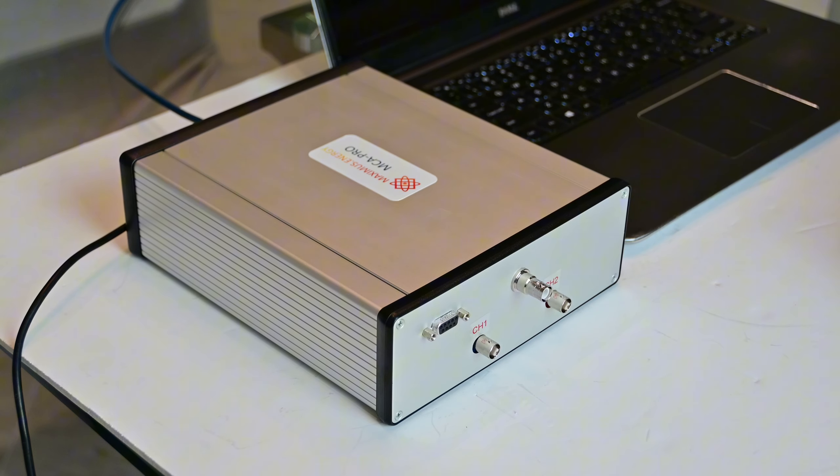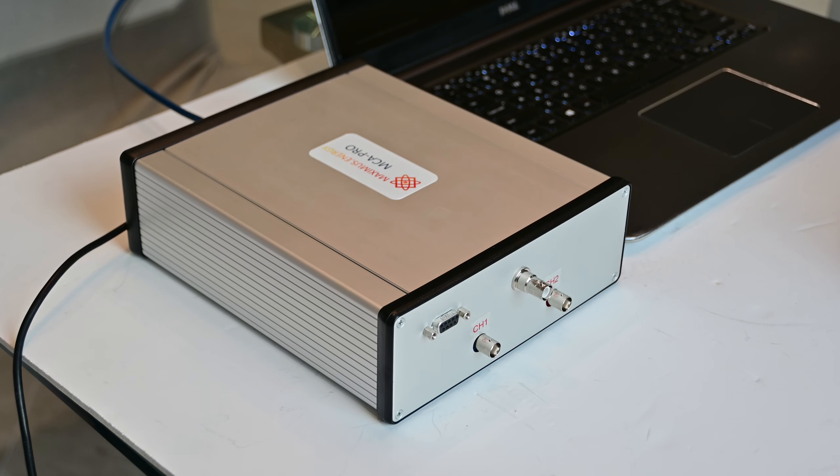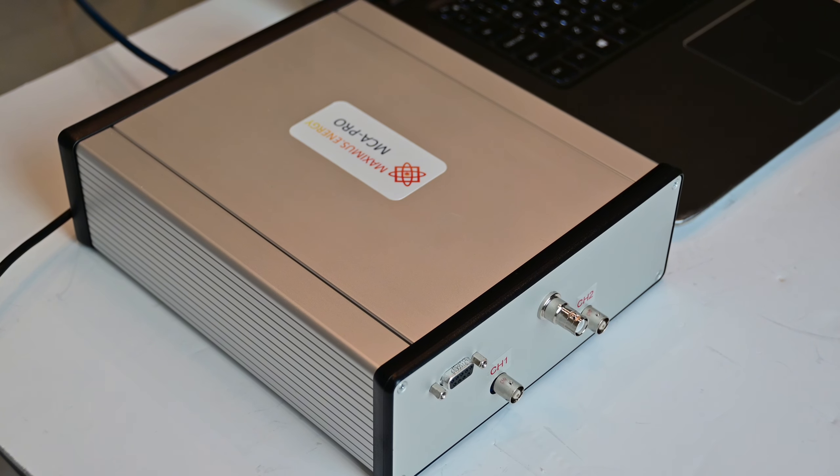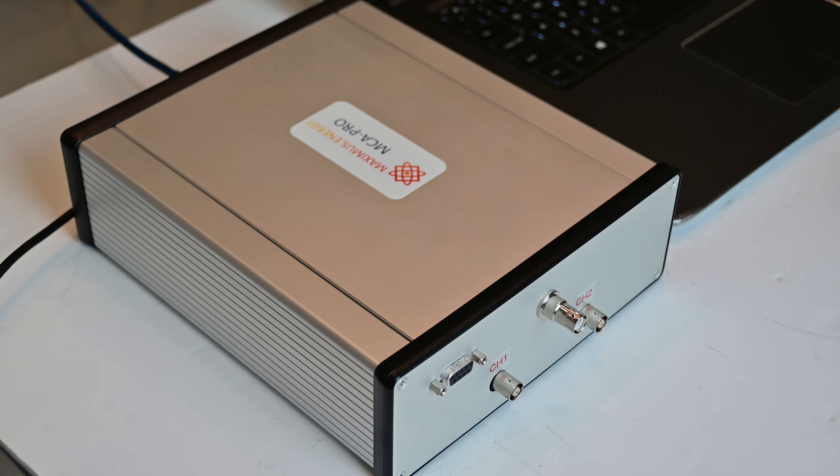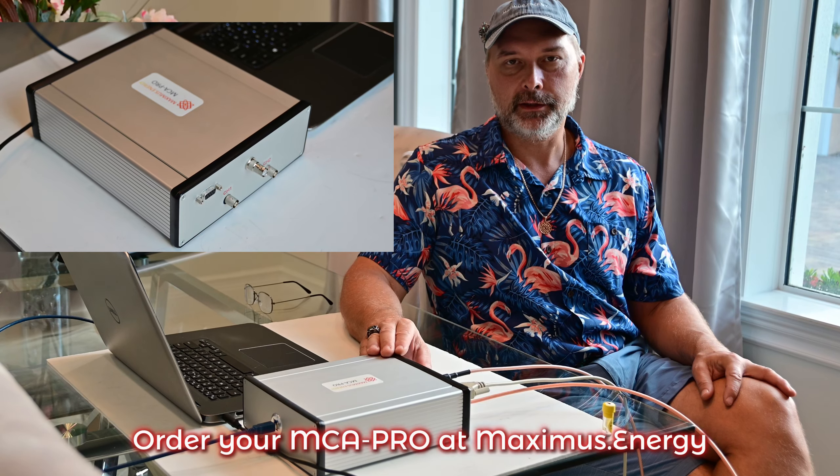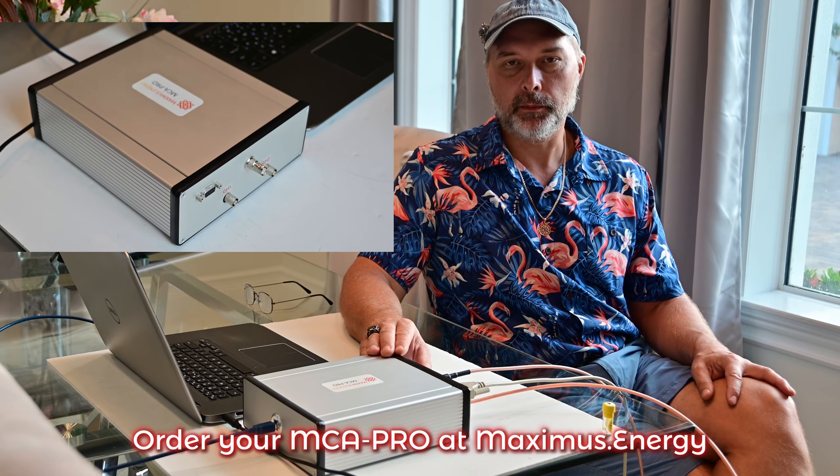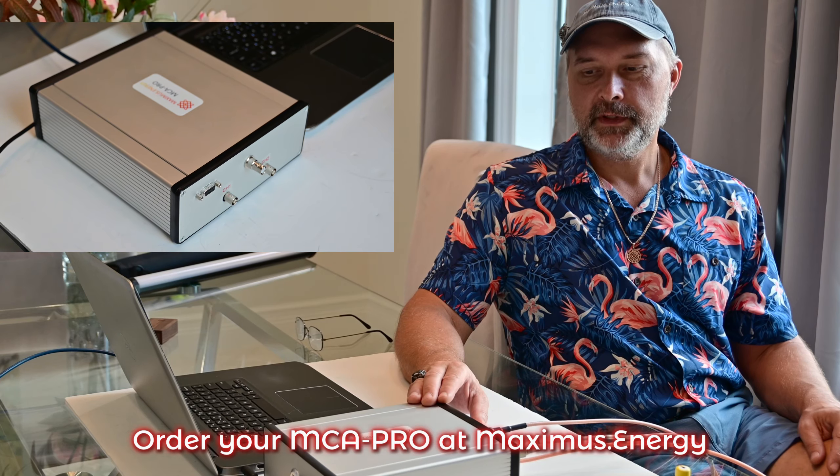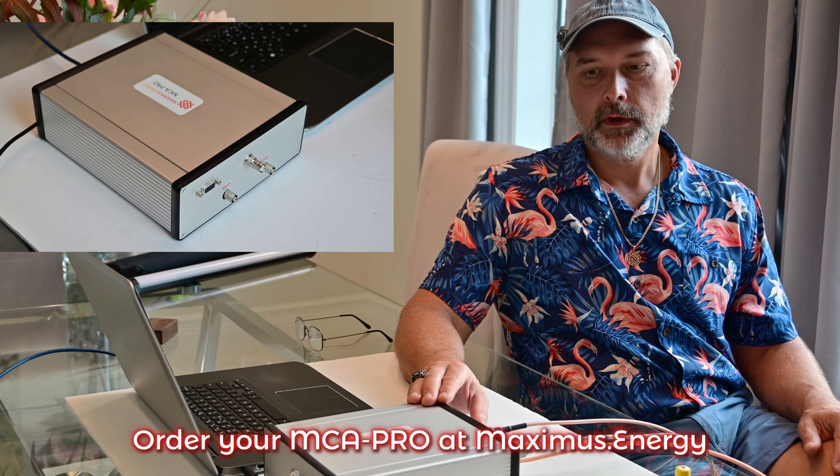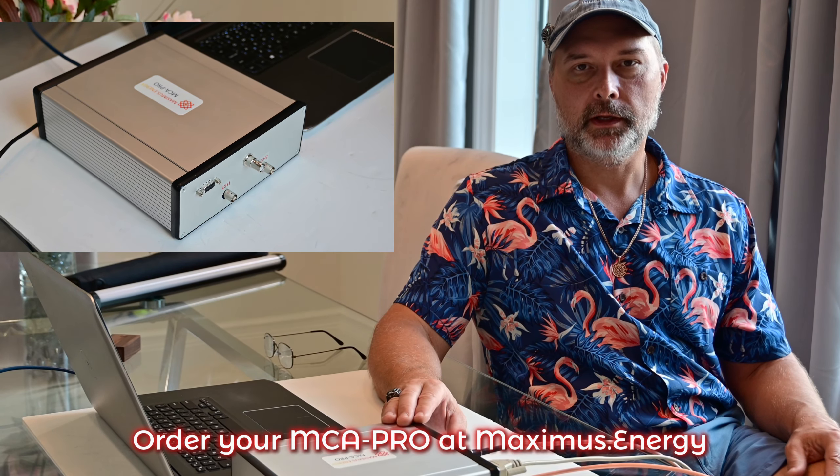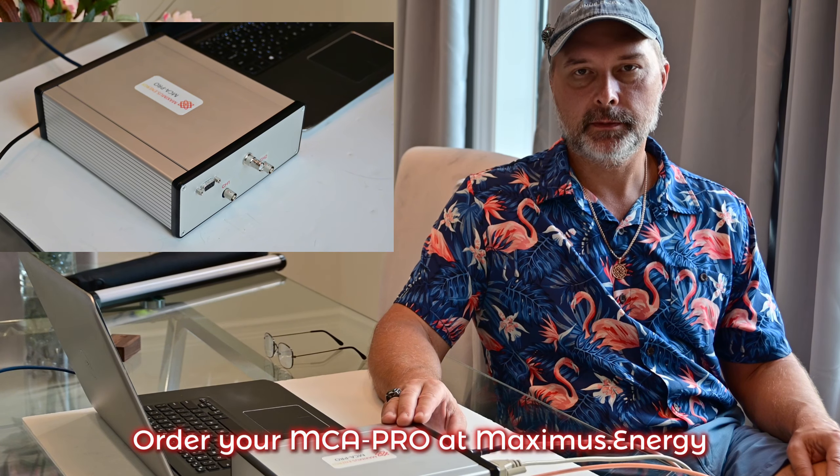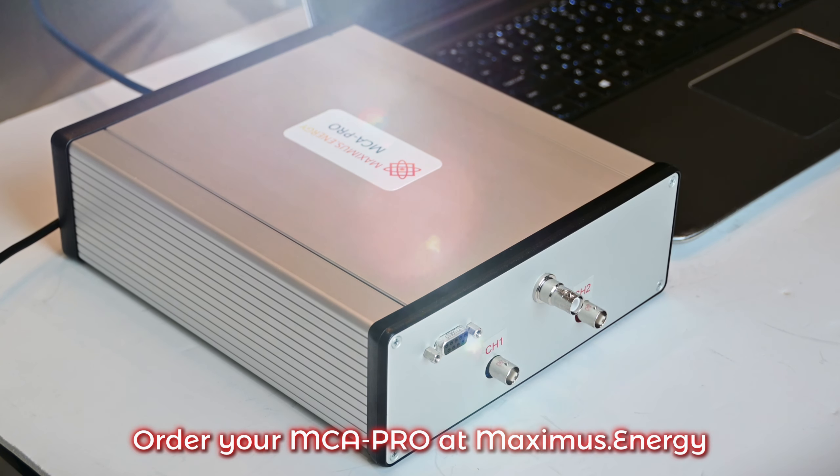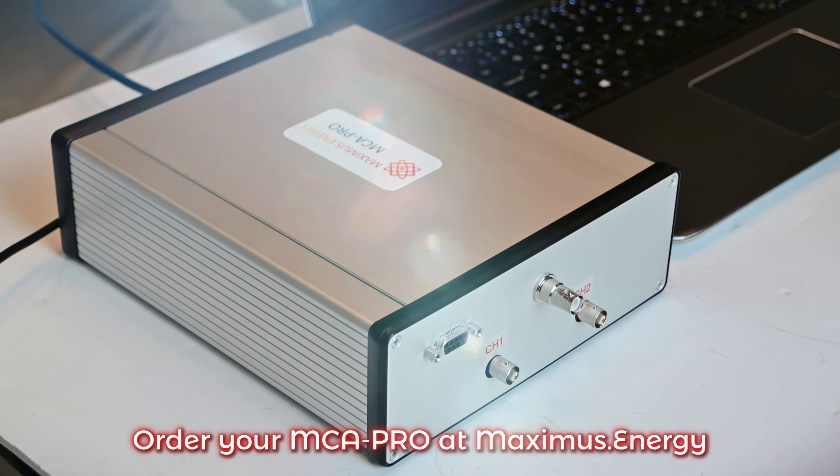MCA Pro with a preamp power supply is a cost-effective solution for high precision germanium spectroscopy. It is a turnkey solution that will work right out of the box, and all you need is MCA Pro. It has preamp power supply and bias voltage power supply, multichannel analyzer and pulse processor all in one box. MCA Pro comes standard with pulse counter Pro software. Order yours at my website, Maximus.energy.